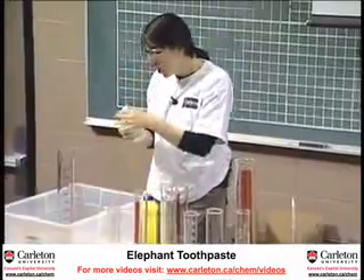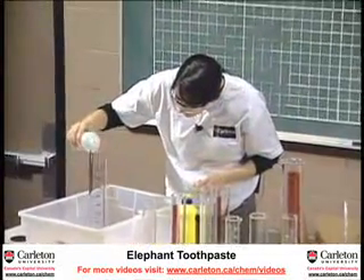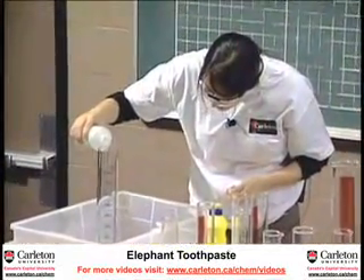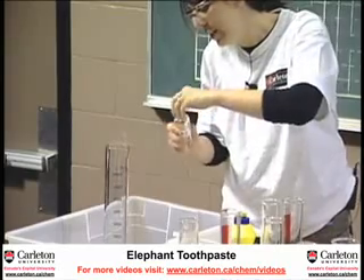We start off with just some soap. We're going to throw in a little something and something. And then, this is the gray.